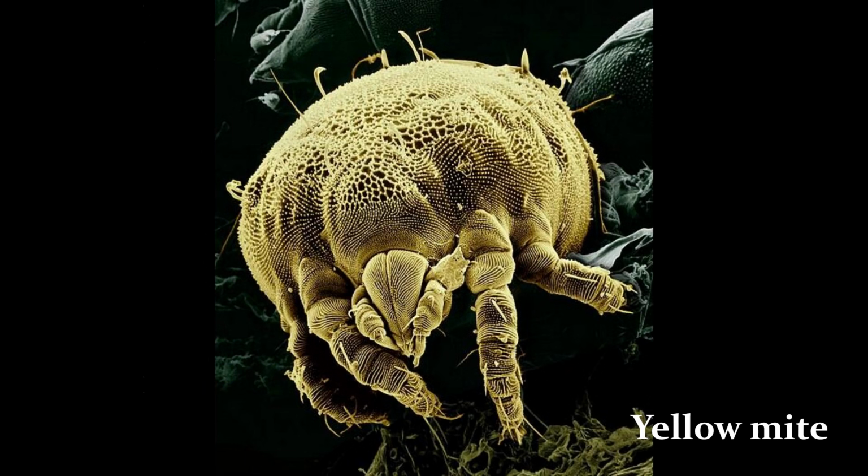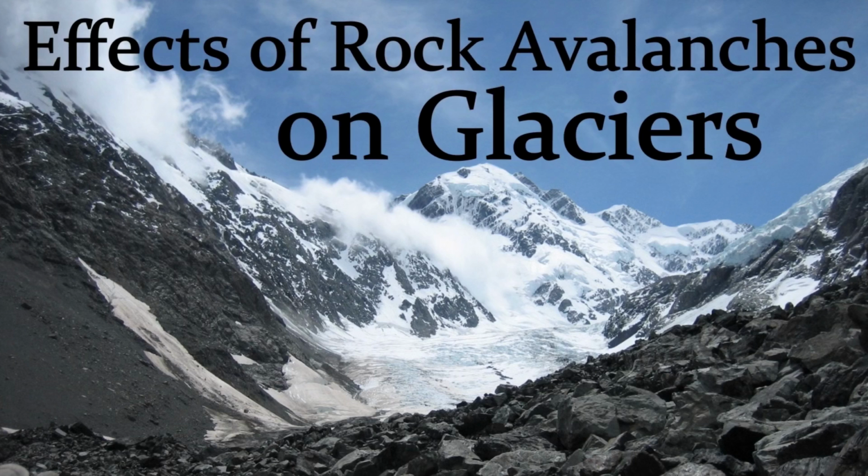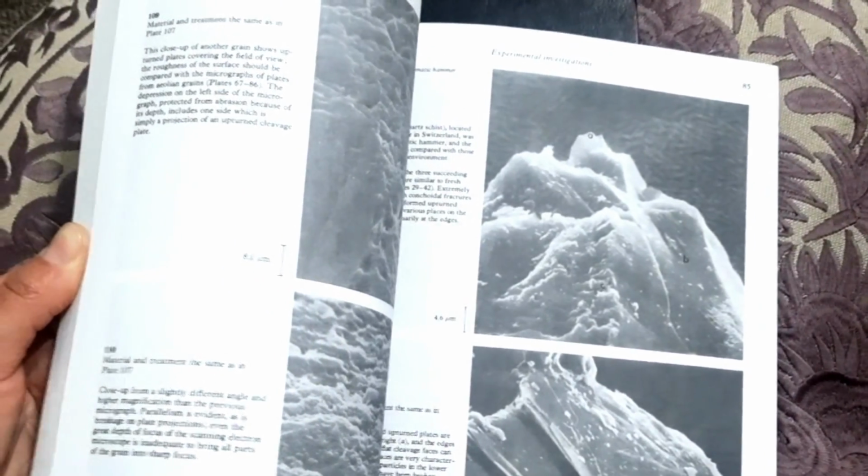I came across SEM through my studies too, and it's actually played a dramatic role in my research. I was looking at the very small nano-sized particles in sediments, in the valleys, coming from different environments, comparing them and creating patterns. There was a big research done in the 70s and 80s about the sand particles, just the fine particles, usually hard crystals which you find in the sand, for example the quartz, which has been ground through its travel, depending on what it is, for example if it's been in a river, or under the ice in a glacier, or on the slopes or on a beach.